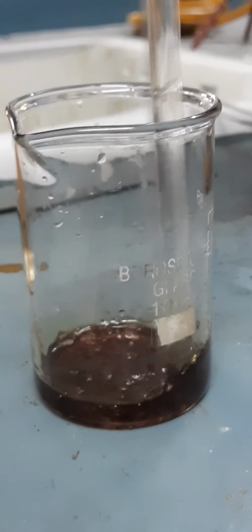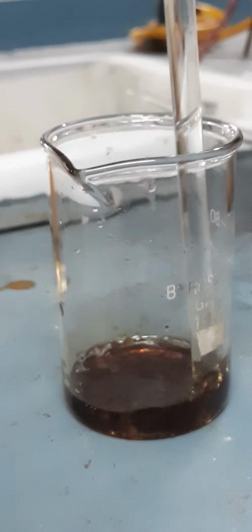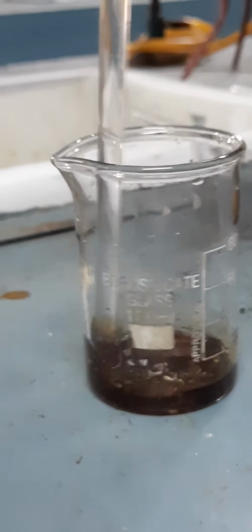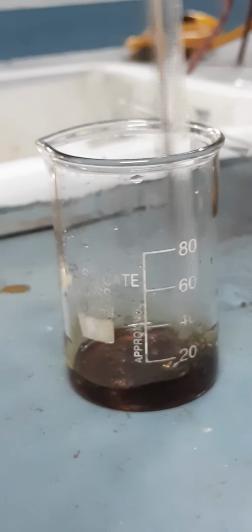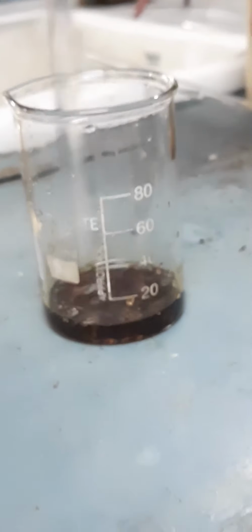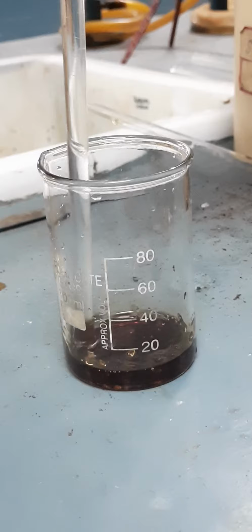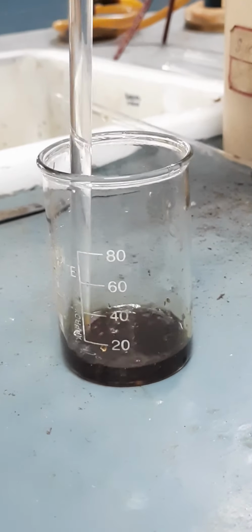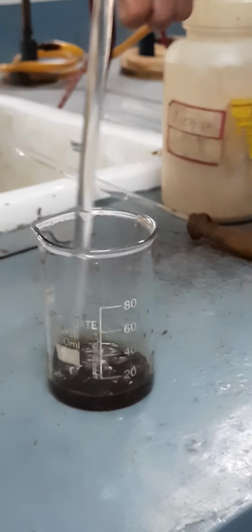The reaction is taking a little bit of time because the sugar was in crystal form, not in powder form. But you can see that the color is gradually changing.